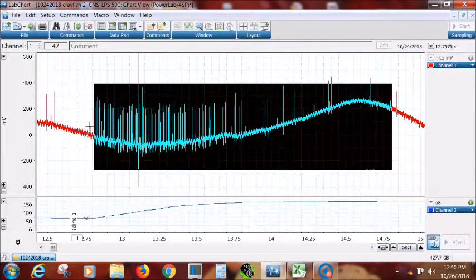And now what we can do is where our marker is, we can move this back up here and say begin at the beginning. And you'll see that over here to your far right, it's going to actually take a count wherever the cursor is. So we're starting at the beginning of this 2-second run. Remember, look up here, where you blackened it out, you know where the end of 2 seconds is, about right there, somewhere close to it, right there, right?